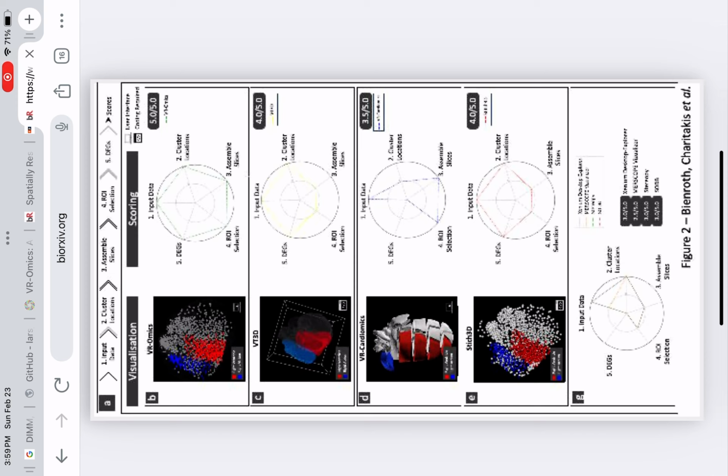This indication of potential dysregulation of the AMPK-mTOR pathway is known to have an effect on mitochondrial metabolism, and has been demonstrated in murine models with mutations in FLCN, the same gene known to be mutated in patient MCHTB302. Without effective analysis of SRT data through framework tools such as VR-Omics, rare clinical samples preserved in FFPE such as these CRMS, prevalent 0.0017% to 0.28%, would remain inaccessible.